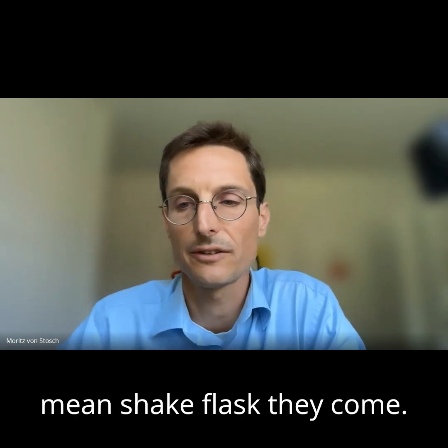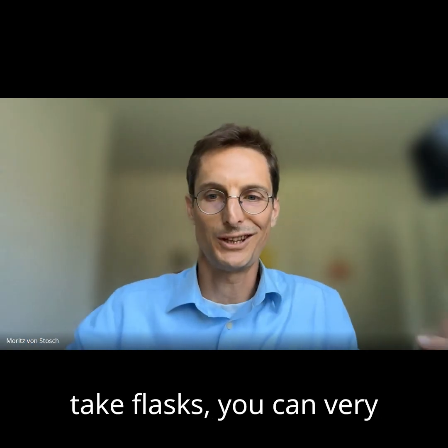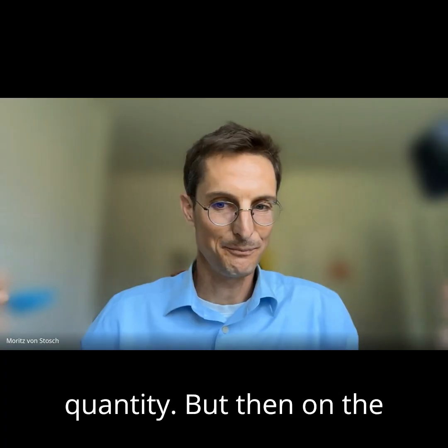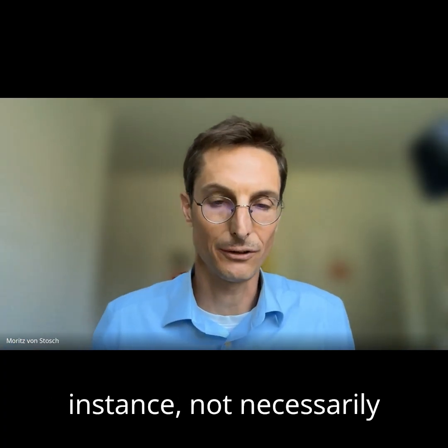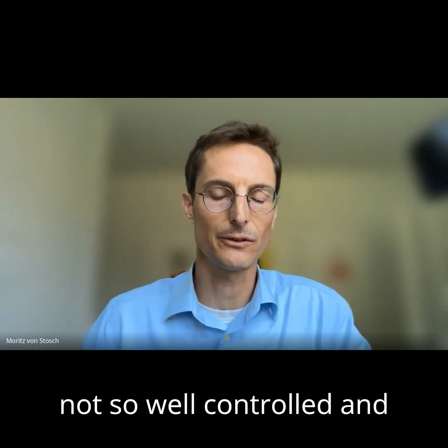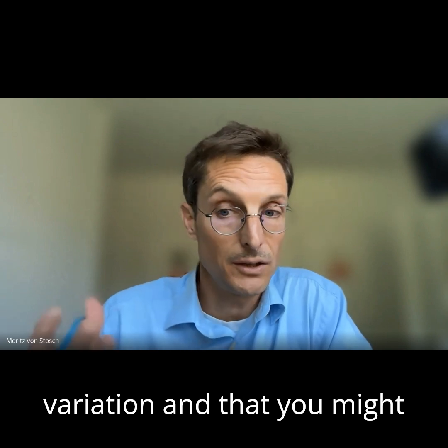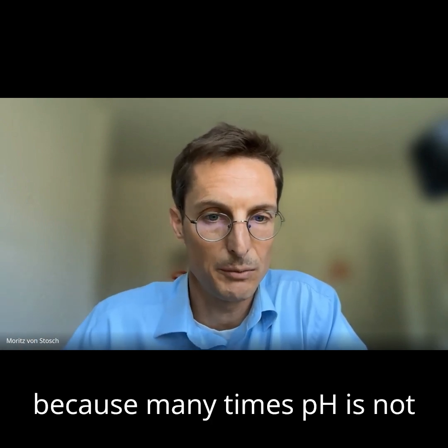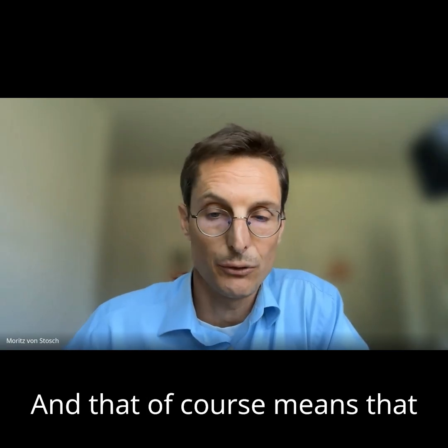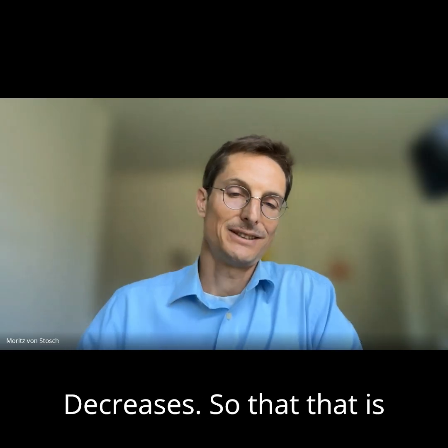And then, shake flasks come with their own challenges. Of course, in shake flasks, you can very easily parallelize them, right? This is nice for data quantity. But on the other hand, you can, for instance, not necessarily control pH or dissolved oxygen. The conditions are not so well controlled, and that might give rise to variation that you might not even be capturing, because many times pH is not systematically measured. And that, of course, means that data quantity is there, but data quality decreases.